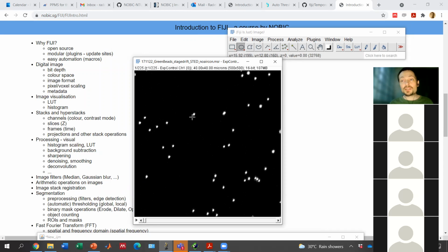And if I don't have anything fast moving there, then I can assume that the change between two consecutive frames is relatively small. And if I find such a shift of the images which makes the two consecutive frames as similar as possible, then that would be the correction for the drift.